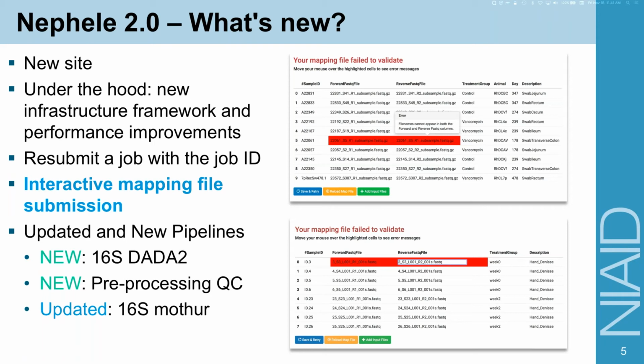We think that's a little bit better than tacking it on at the end of the analysis pipeline, because, as I talked about today, sometimes you don't know how to set the sampling depth or any of the other parameters unless you see the result, right? So we're definitely planning to add that. I think we'll probably start out with diversity analysis using the new QIIME 2 diversity analyses, which has all of those diversity measures.